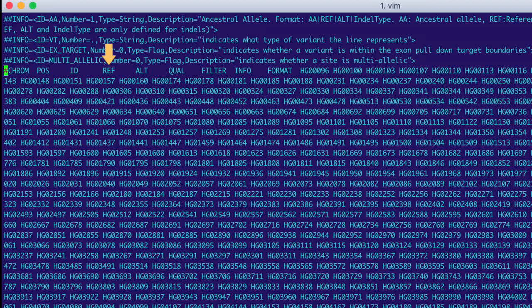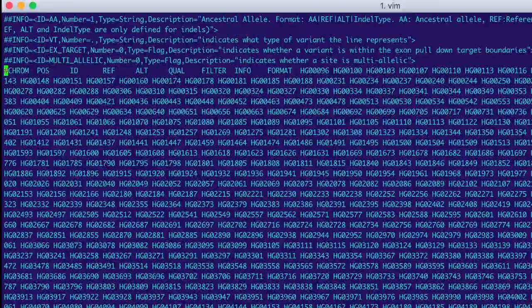its reference allele, its mutant or alternate allele, its quality, whether it passed the filter applied, and finally, the additional information.